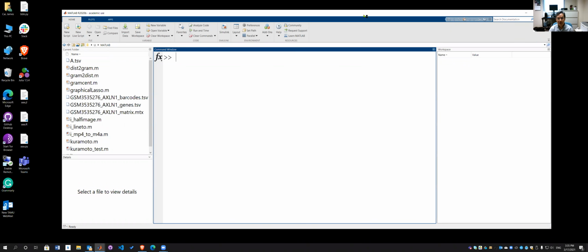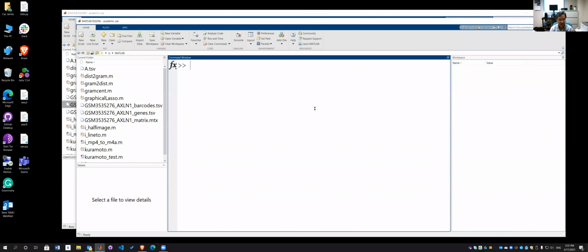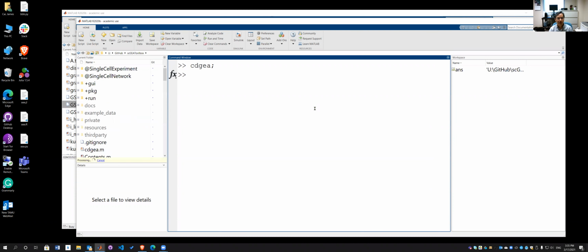So I just bring up a new fresh MATLAB environment here.